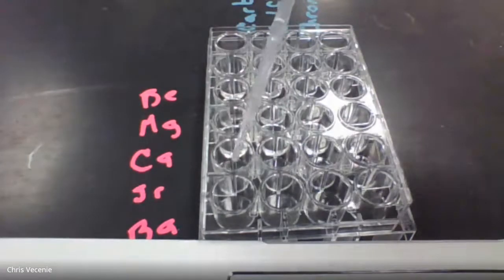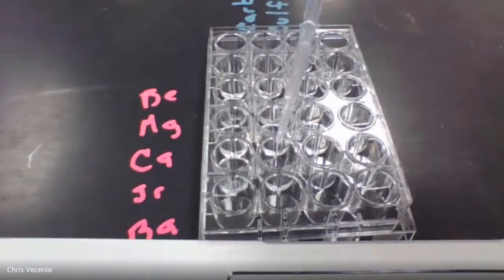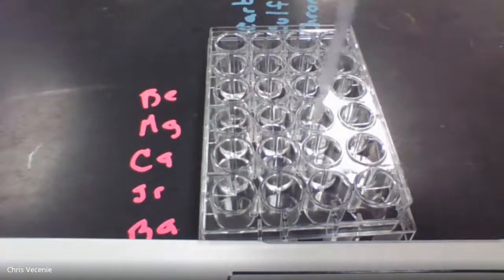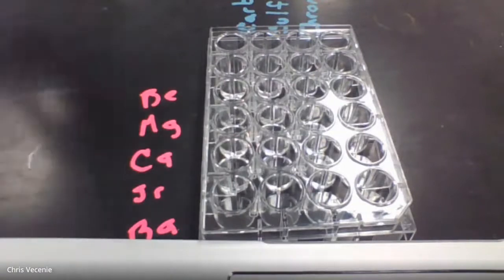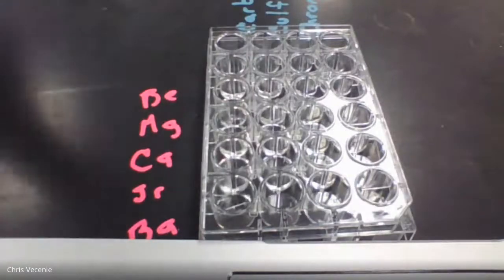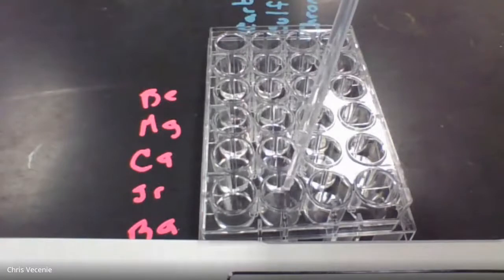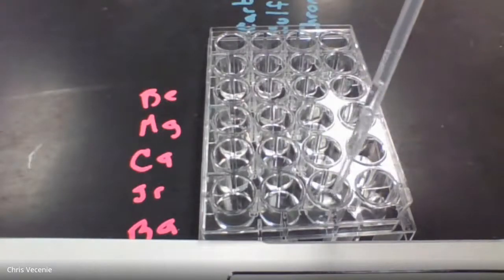And we do the same with the strontium. 10 of the strontium. And then lastly, 10 of the barium. A little bit more. 10 of the barium.